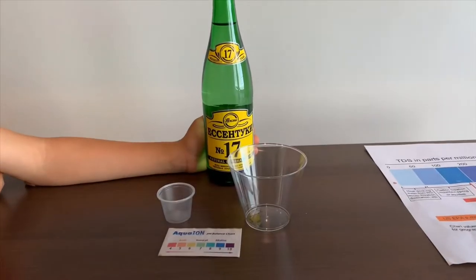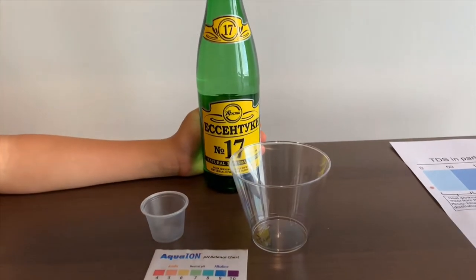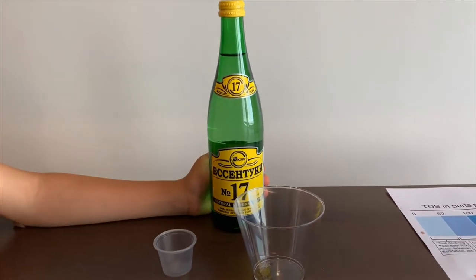This is a Essentuki natural mineral water. It costs $1.29 and it's sourced from Russia. Let's test the pH and TDS levels.